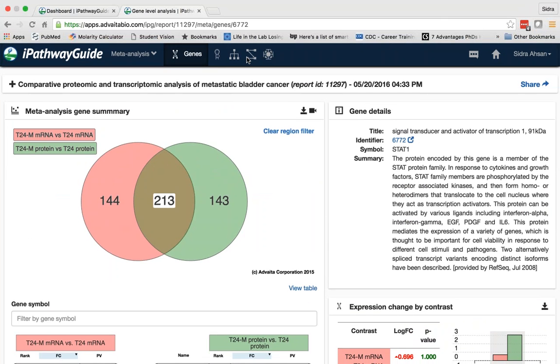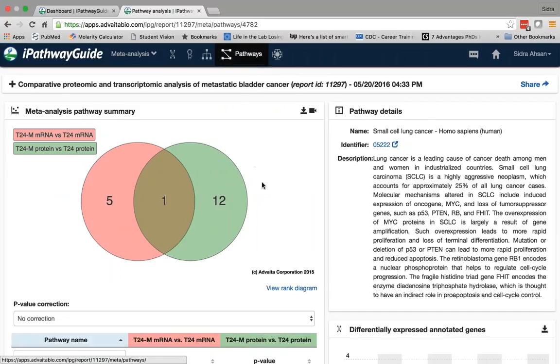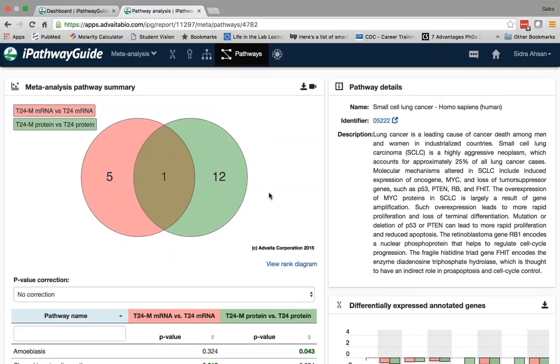So now I'm going to answer these questions. I'm going to first look at the pathways that are common or unique between the proteomic and the transcriptomic data set. This was really interesting to me, that even though there are so many genes and proteins that are common amongst the two different types of data sets, there's only one pathway that came up to be significantly common amongst the protein expression and the mRNA expression data set.